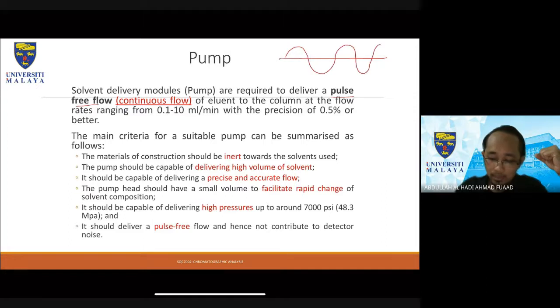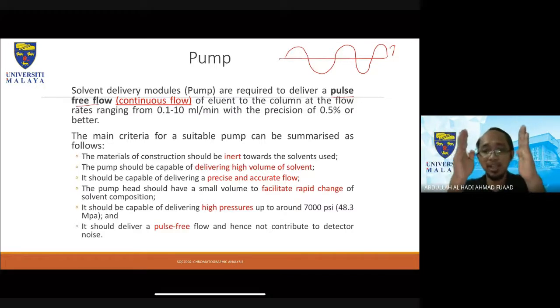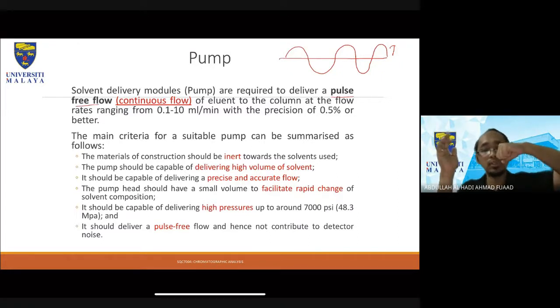An increase in pressure is when you have a space. Imagine the size of my head is a space and the piston is originally in the middle, at my nose. As it compresses, you get a higher pressure, and then as it returns to its original location, you get zero motion here. And when it moves to the back, you go to a negative value.